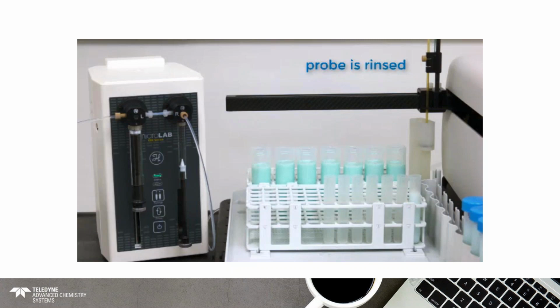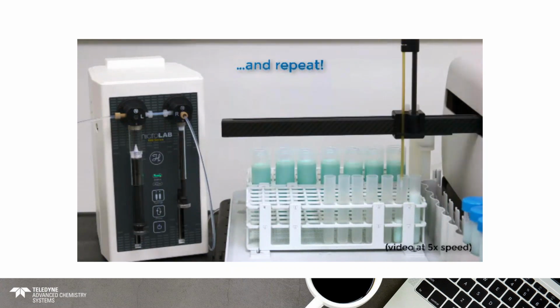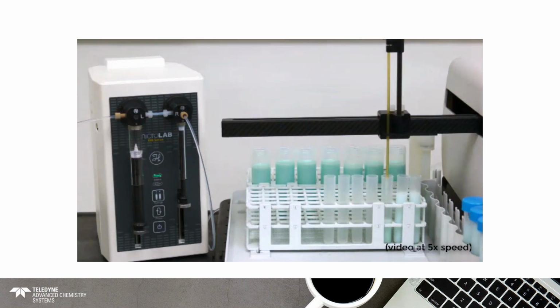The rinse step completes, and the rinse step I mentioned, it's totally optional, and you can increase or decrease the amount of rinse used to meet your needs. And then we simply speed up the video. You can see as it goes through and produces one prep after another.